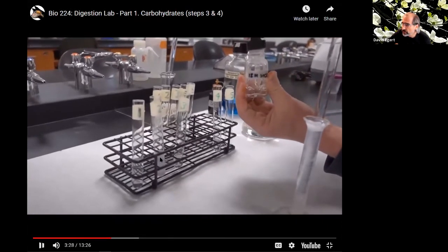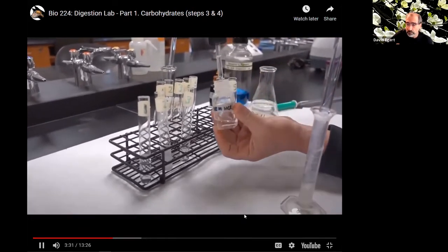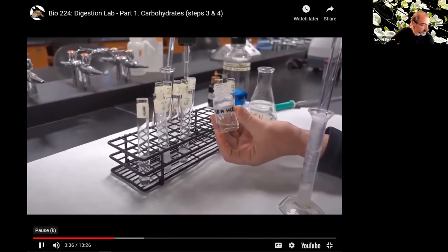I should mention this is a much higher concentration of acid than we use in the protein lab. The protein lab was using like half molar. This is almost 25 times as concentrated hydrochloric acid. So this is really like with a vengeance, to denature the amylase here. Add 5 drops of the concentrated hydrochloric acid here. 1, 2, 3, 4, 5.